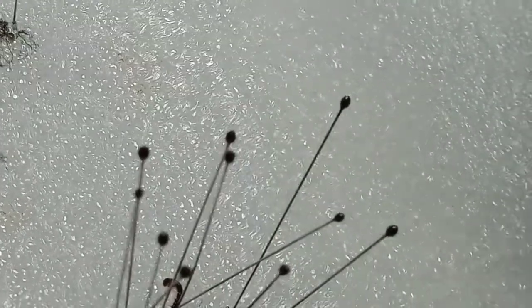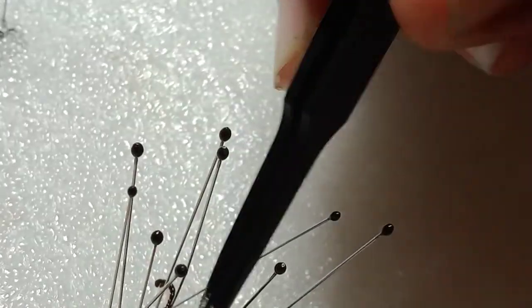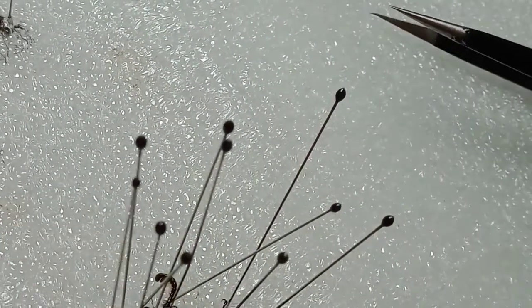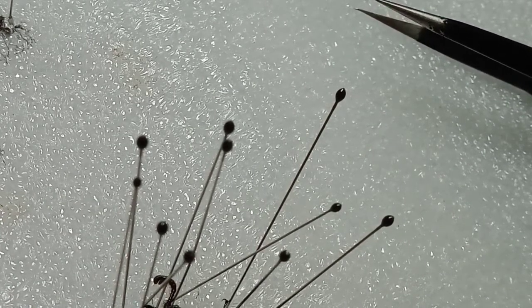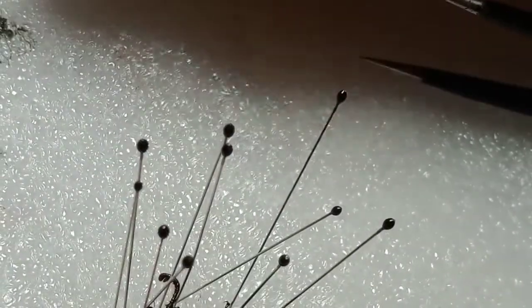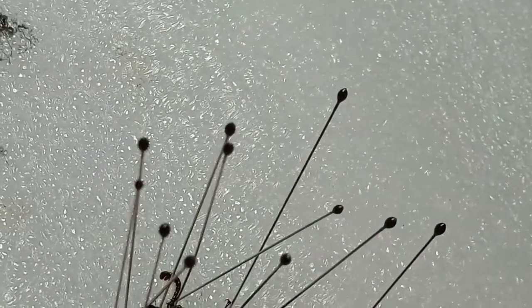If you want, you can also add more details to it. As you can see, I made a mistake right there. There you go — forgot to secure this. And that is how you pin a beetle.